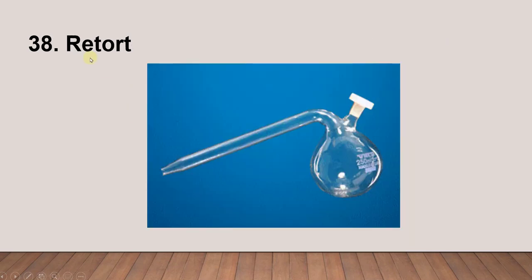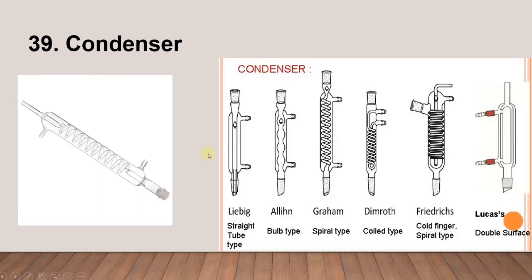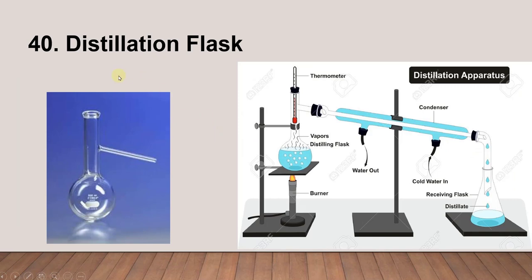Next is the retort. Next is the condenser — we have different kinds of condenser for different purposes. Next is the distillation flask. You can see how the distillation flask, thermometer, and condenser connect together.